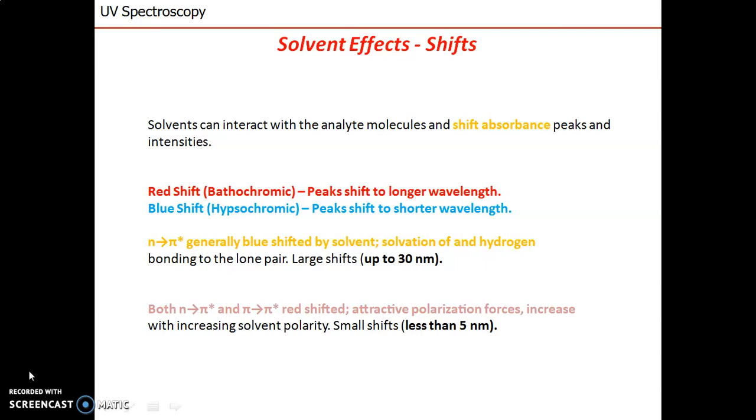If paracetamol has more solubility in NaOH, it shows absorption at 257 nanometer, but in water paracetamol is not fully dissolved, it does not show that proper absorption and it shows its lambda max at another wavelength. And in HCl it is also not very stable, so it shows lambda max at another wavelength, as well as the absorption maximum is shifting and the amount of absorption is also shifting due to the solvent effect.